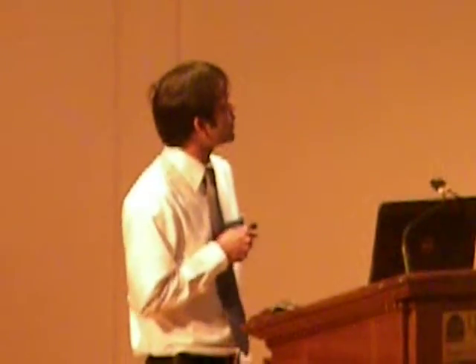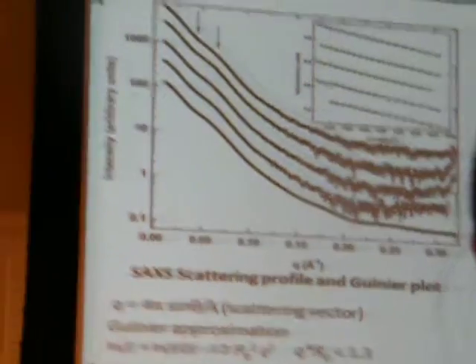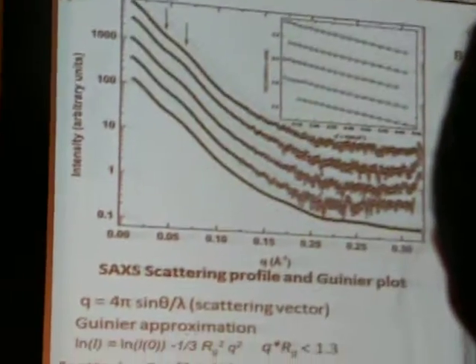I have done many multiple samples, so it makes sure there is no problem in the protein. As I showed, this scattering profile, with the signature of the depression and the bump, can be transformed into the pair distribution function, which is the histogram of the interatomic distances within one molecule.